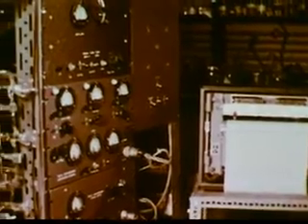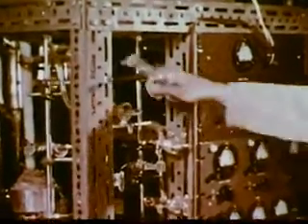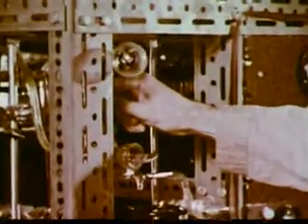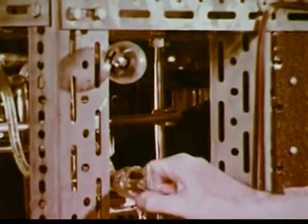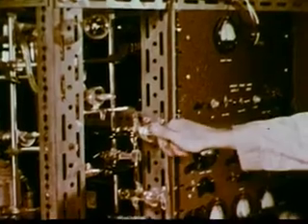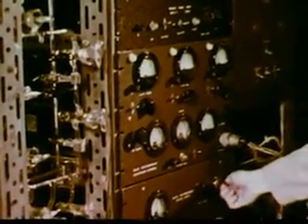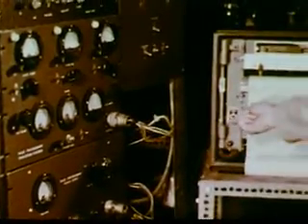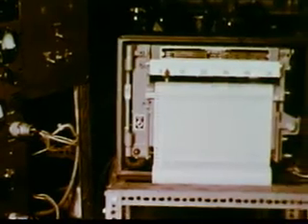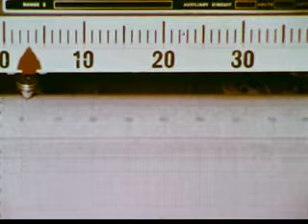We will use this mass spectrometer in order to detect oxygen 18. First, a flask containing some ordinary water is connected to a vacuum system and the air pumped out. Then water vapor from the flask is introduced into the spectrometer, where it is ionized and passed through a combination of varying electrical and magnetic fields, then strikes the detector. An electrical impulse from the detector is transmitted to this pen, which moves to the right when ions of each mass strike the detector. The paper moves beneath the pen.